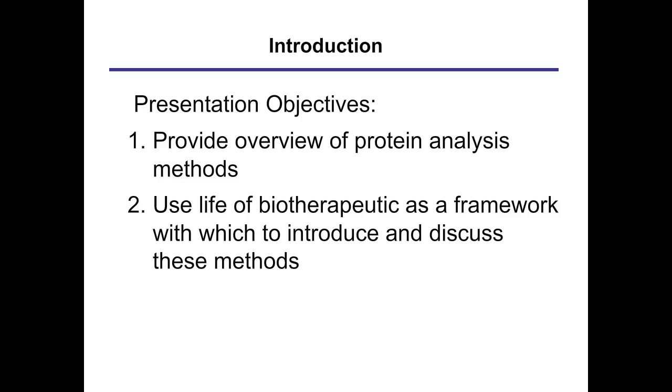For the purposes of today's talk, we're going to follow the life of a prototypical biotherapeutic from the stage at which discovery is occurring, biological discovery in cells and testing hypotheses, onward to the course of expression and purification of proteins, to further doing binding analysis and surveying protein interactions, and then onward to biophysical characterization. We won't talk so much about downstream work in manufacturing.